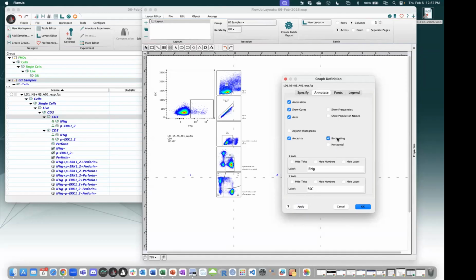Also, FlowJo has a true backgating. It's going to gate on the last population you display, so right now CD4, and it's going to show you, if you apply this CD4 gate on all your events, where those events will fall. You see that most events fall in my forward scatter side scatter at the right place, and the doublet discrimination. You see some CD4 positive in my live dead marker, but the cells can die, and you can see some CD4 positive in my HLA-DR positive, CD3 negative. Well, we know that CD4 can be expressed in monocytes and granulocytes, so nothing to worry about here.